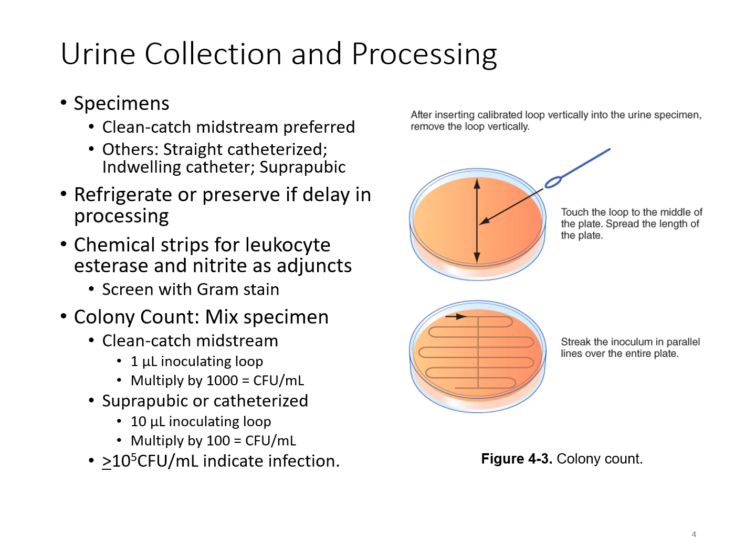And again, just a reminder that a colony count is performed on urine specimens. So if you look at this culture plate here, this is the setup for urines. Most cultures are just going to do that 3-quadrant streak, but for urines, you're going to streak down the center, and then you're going to cross streak it. You come back over that original line and cross streak it, and then you're going to do your colony count. Depending on where your colonies grow and how many you have, you're going to quantitate those based off of the particular size of the loop that you use.